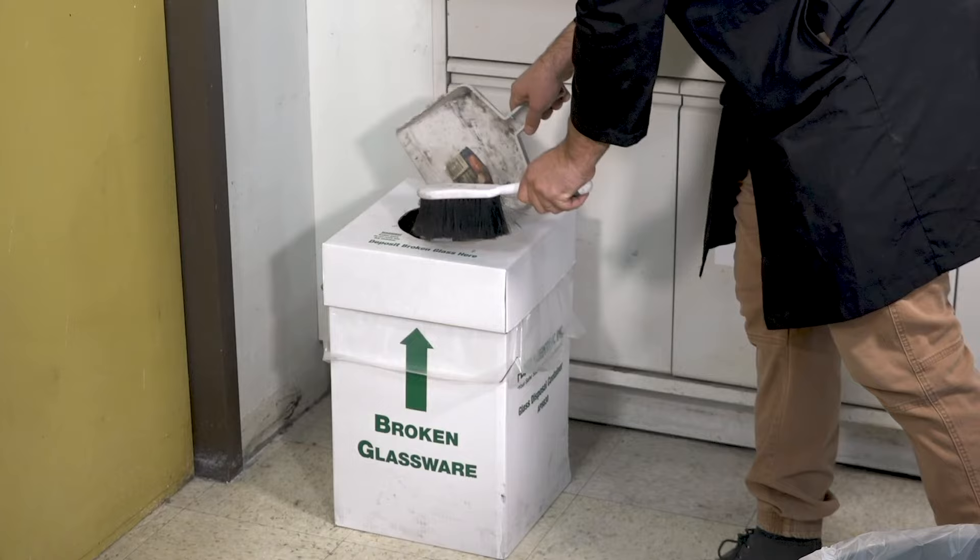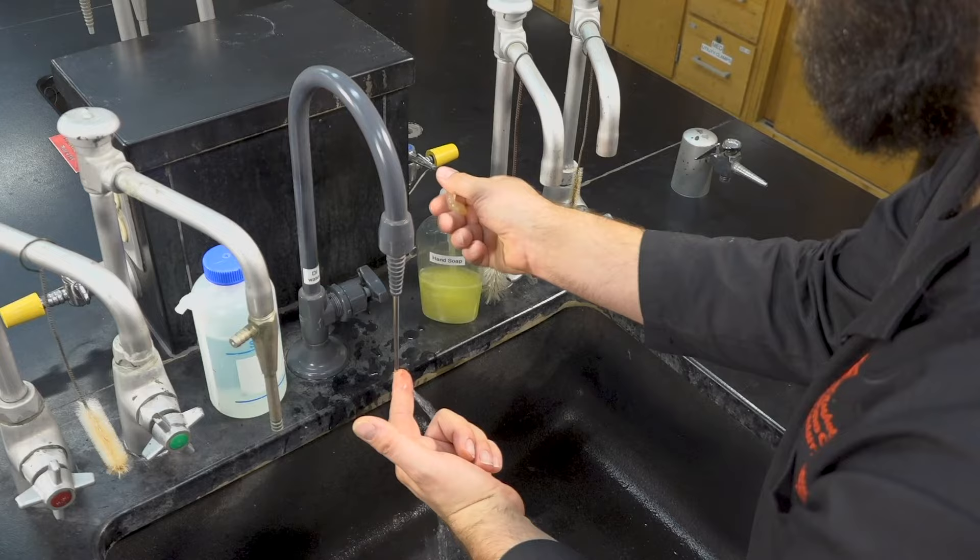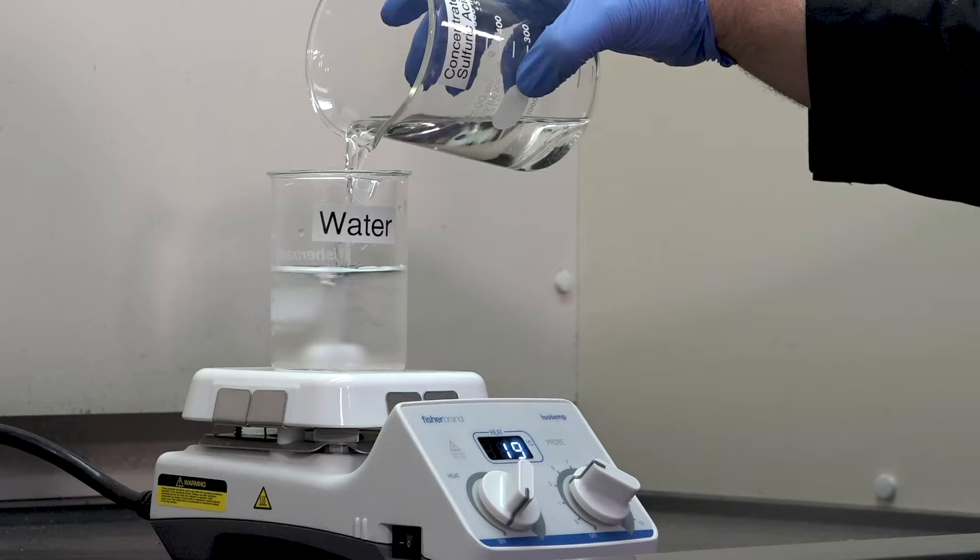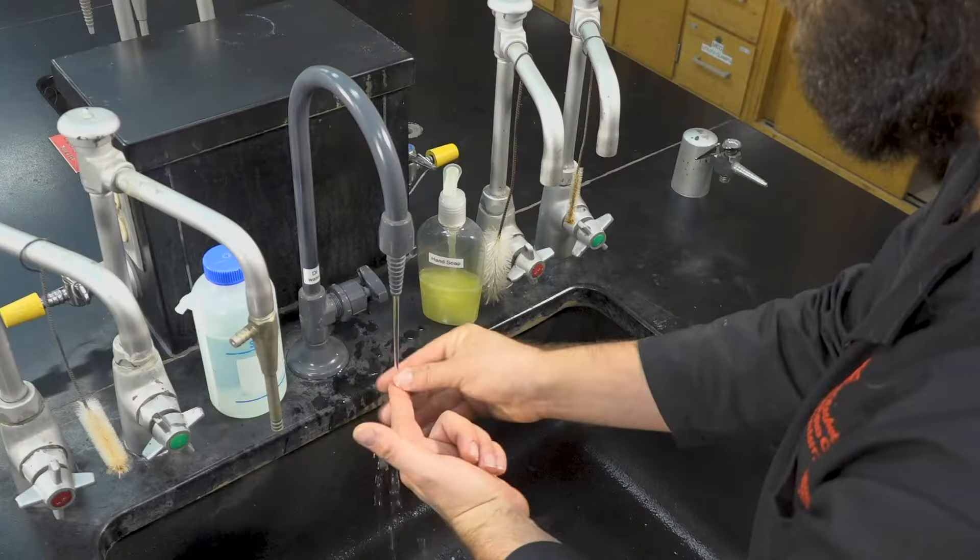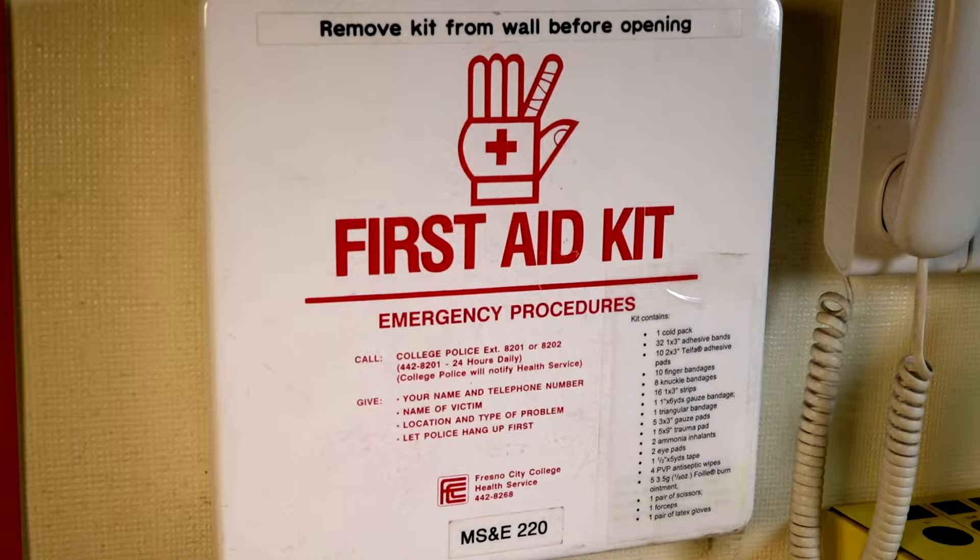In the event that you do cut yourself, it is important to clean the wound sufficiently. This is especially important as we are in a chemistry lab, and the glassware may be contaminated by dangerous chemicals. Rinse the area thoroughly with soap and water. Your instructor will provide you with a basic first aid kit containing bandages and antibiotic ointment.